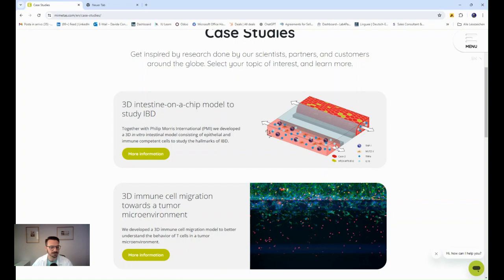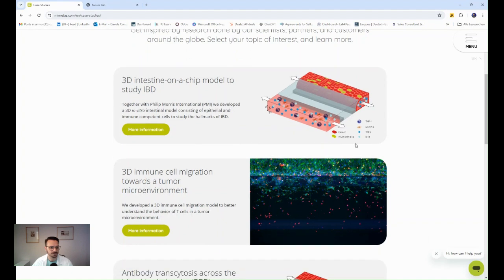They also use it as a possible way to let different compounds diffuse, and then they can inject into one of the channels that are already vascularized the different compounds, or without the endothelial cells, and look at the interaction in the blood flow directly. So this is one of the possibilities.